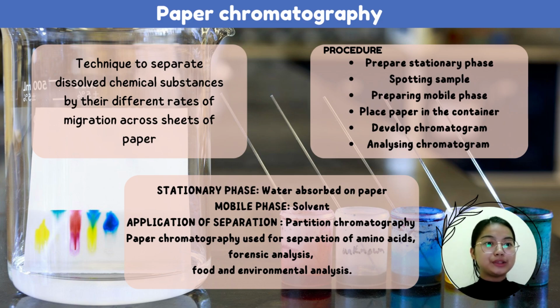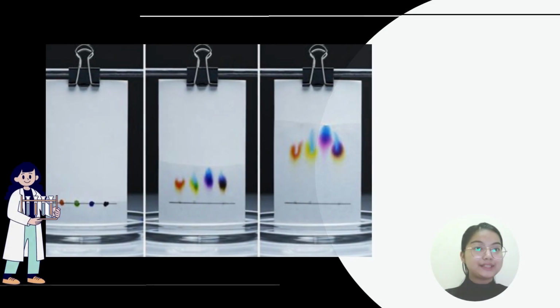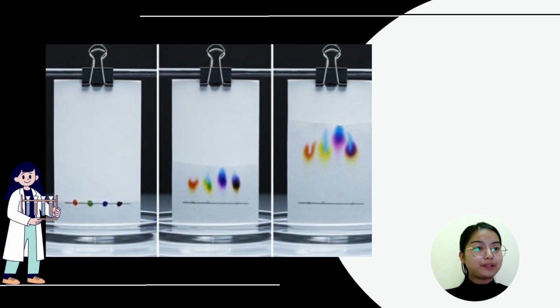This technique is used for separation of amino acids, forensic analysis, and food and environmental analysis. This is the visual diagram for paper chromatography.